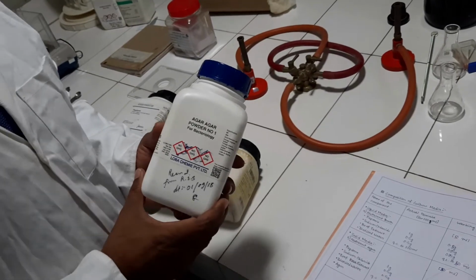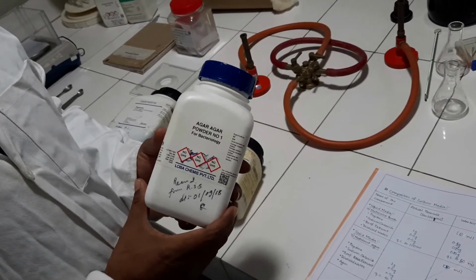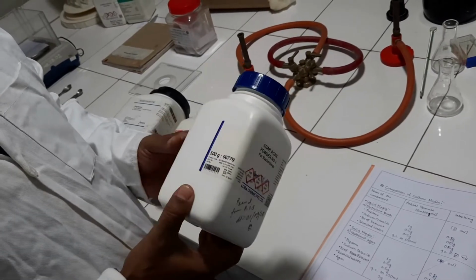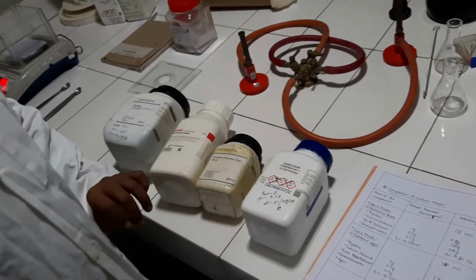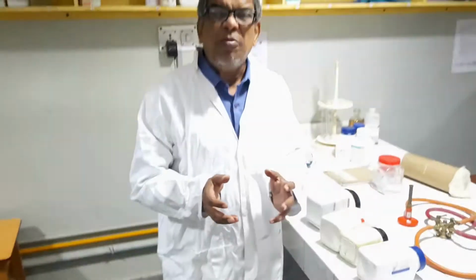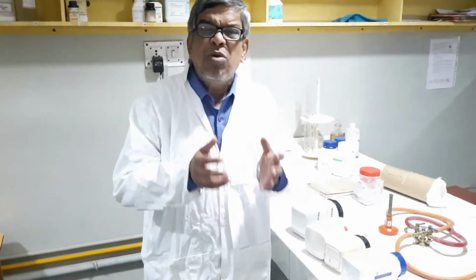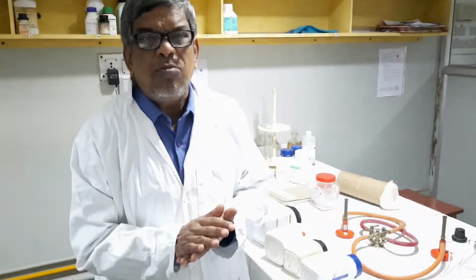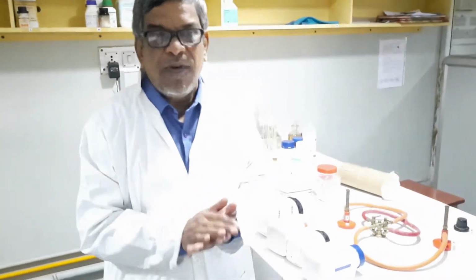In the autoclave, it will remain as liquid. But due to the presence of the additional compound agar-agar, when you cool it at room temperature, it will be solidified.